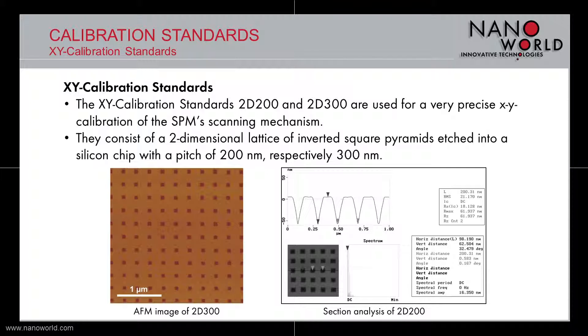On bottom right you can observe a section analysis of an AFM image of the calibration standard 2D200. The distance between two consecutive minimums is 200.31 nm, which is very close to the 200 nm expected.